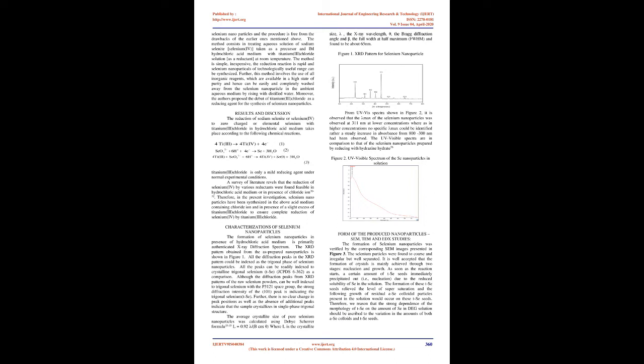The other types of methods cited above, besides being tedious, necessitate use of expensive state-of-the-art technologies, and to provide appropriate culture medium for the growth of bacteria is a difficult task in the fermentation procedure. In the present paper, we demonstrated the use of titanium(III) chloride as a reducing agent to generate selenium nanoparticles, and the procedure is free from the drawbacks of the earlier ones mentioned above.